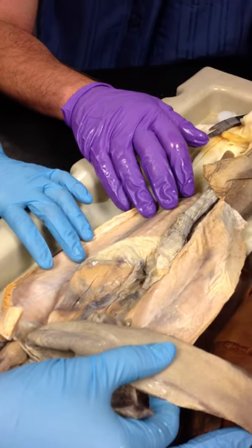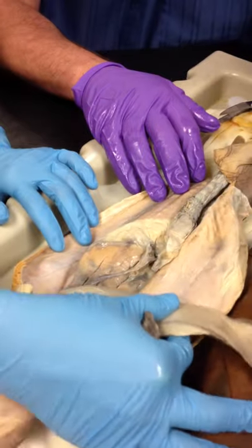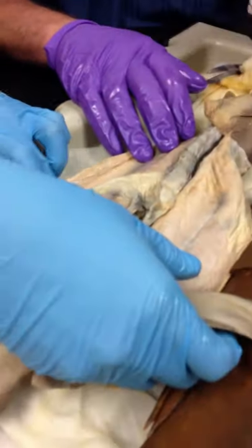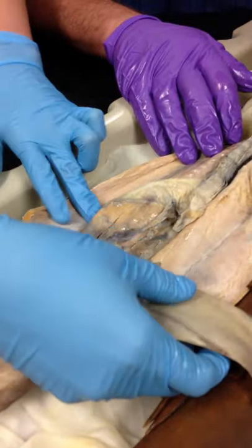What does it feel like? I was going to ask you to do that. It feels good. It's squishy and soft. Do like this with one of your fingers and describe that. Slippery. It is slippery. They're oily, greasy animals.